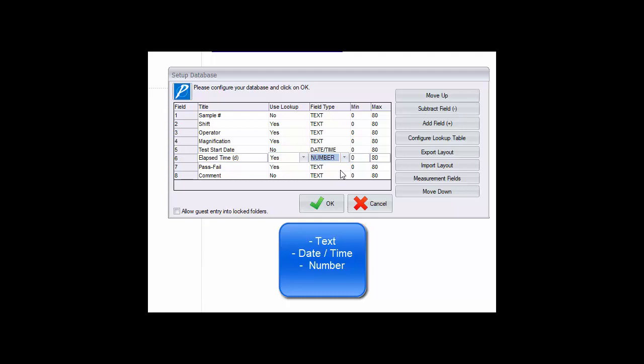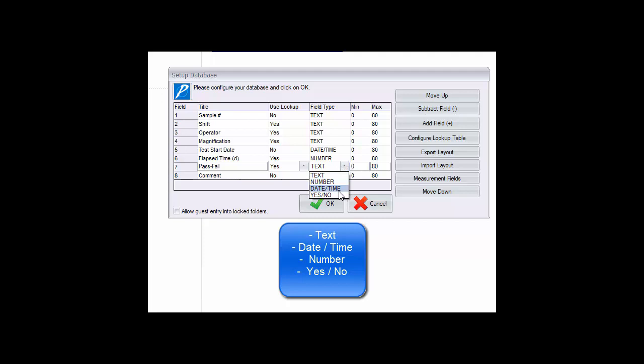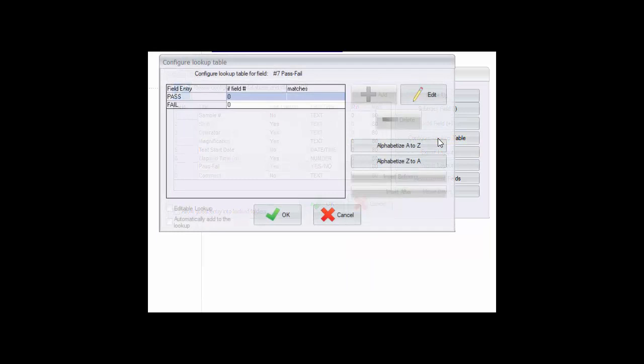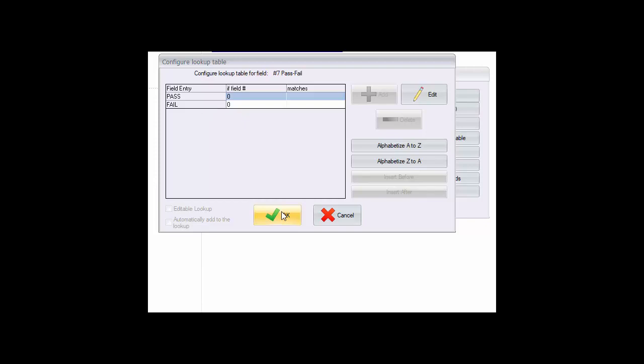And finally there are yes no or two condition fields. Note that for the yes no field, the use lookup designation is automatically chosen and the number of entries is restricted to only the two conditions. You may edit the two items in the lookup table to reflect what makes sense for how this field will be used. For example it may be yes no or true false or pass fail and so on.